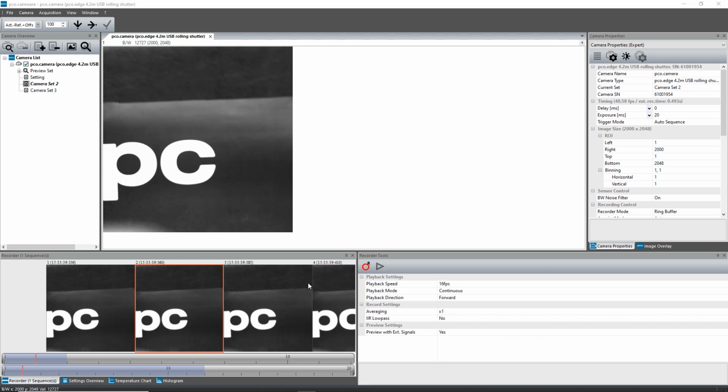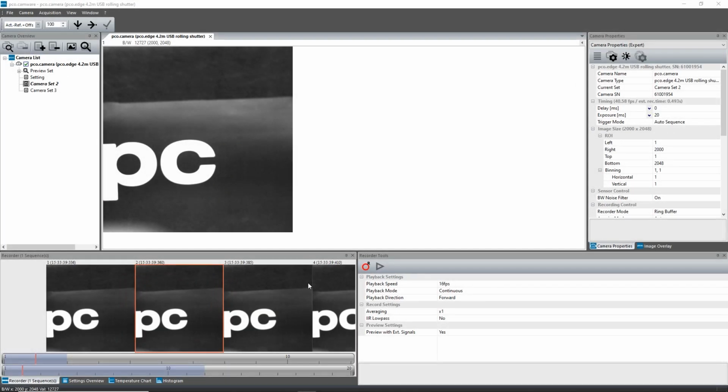For fluorescence microscopy applications, in addition to other specialized multi-channel setups, CamWare from pco offers the ability to overlay images taken under different illumination conditions and to separate these images by color. Be aware that this mode is only available with a monochrome camera. For this purpose, CamWare provides a list of reference fluorophores.